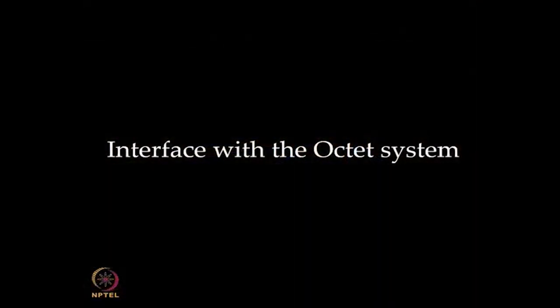Myself Sushilendra Vaidya, application specialist for the ForteBio Pall Corporation. Just now in the last talk, Dr. Shenglan Kao spoke about Bio-Layer Interferometry and its applications. Now I am going to demonstrate how this Bio-Layer Interferometry works. I am going to demonstrate the kinetic studies of monoclonal antibodies, that is, the mouse monoclonal antibody to the protein A ligand.